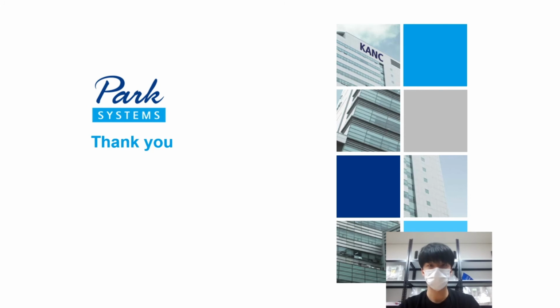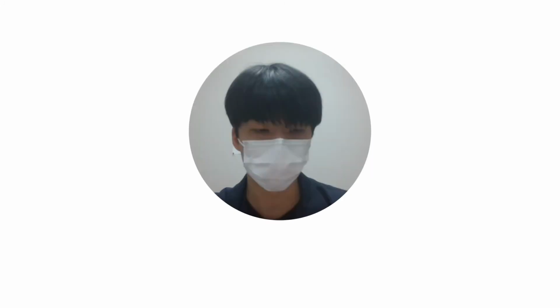Thank you. Okay, Chris, it seems we have our questions now. For our first question: what kind of sample is suitable for non-contact mode? Actually, we can see the roughness of samples with contact, non-contact or tapping mode, but we cannot get the very steep height of a sample. We can get almost all samples, except the kind of sample with very steep height.